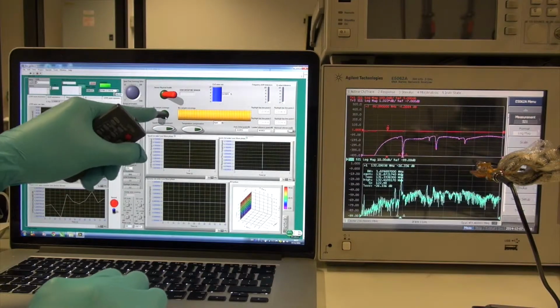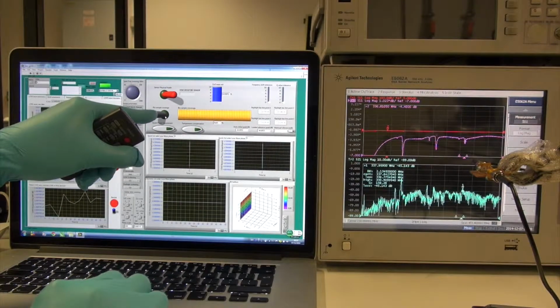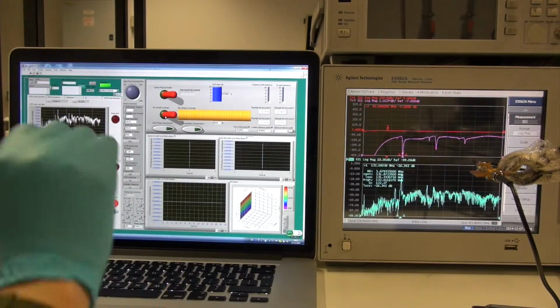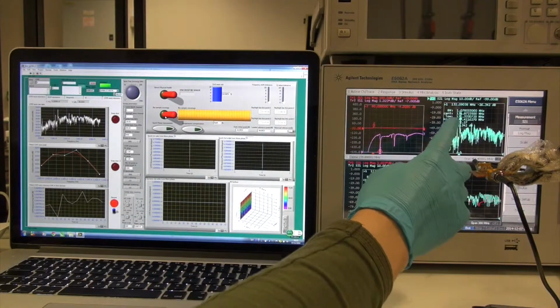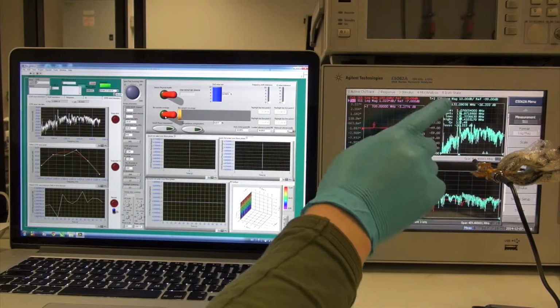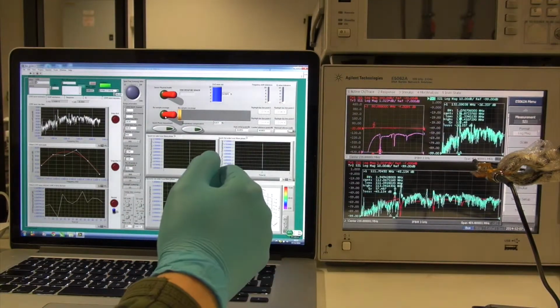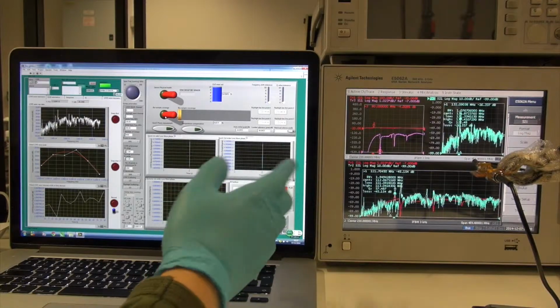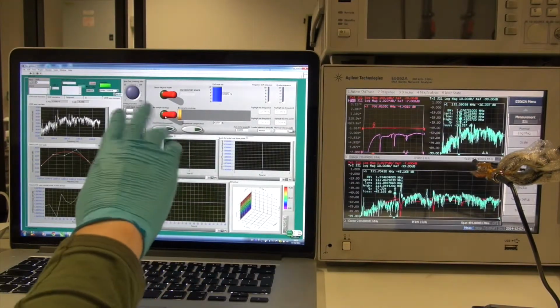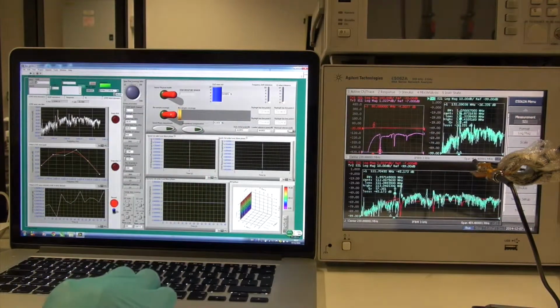Here, for example, if I switch on the device surface coverage analysis switch, okay, I switch this on. You can see there's another measurement engaged, which measures the first order Love wave transmission coefficient amplitude change. And then it can deliver the data to the computer to analyze the surface condition of the guiding layer.